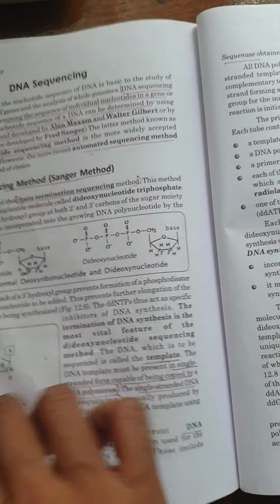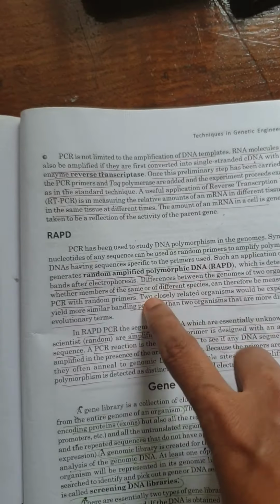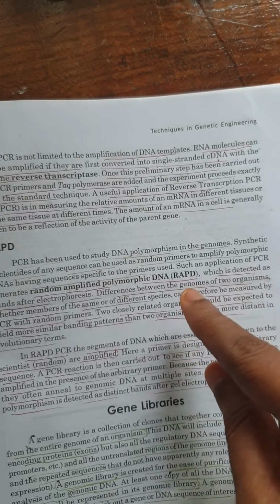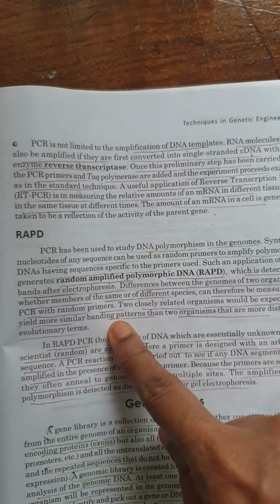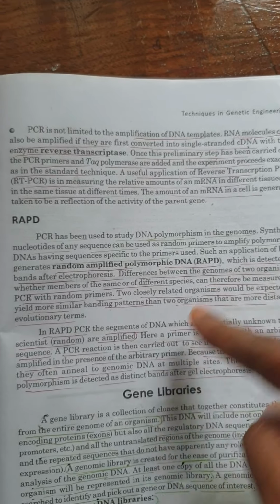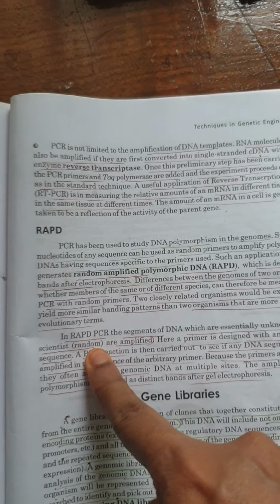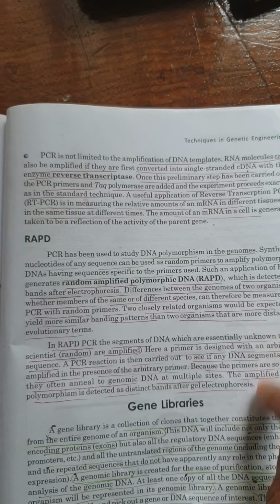Then we will compare it with the known species. So we can study whether the members are closely related or distantly related based on the banding pattern. Based on the banding pattern we get in the electrophoresis, we can study the phylogenetic relationship between these species. So in RAPD PCR, the segments of DNA are essentially unknown to the researcher.